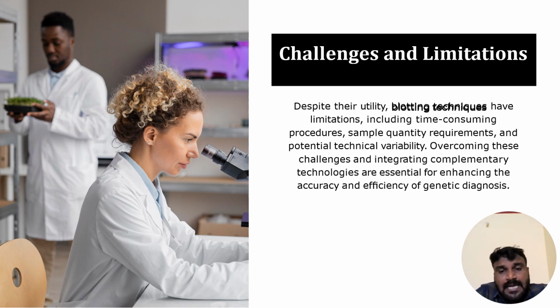So what are the challenges and limitations that we may face using these techniques? Most of the techniques are time consuming and have long, lengthy procedures, and sometimes we may not have enough sample for diagnosing or for running the gels, and sometimes we may have technical variations. So to overcome these challenges, we can integrate other complementary techniques to enhance the accuracy and efficiency of genetic diagnosis. For example, we can even go for sequencing or MLPA to detect deletions, or we can use other techniques to complement these challenges.